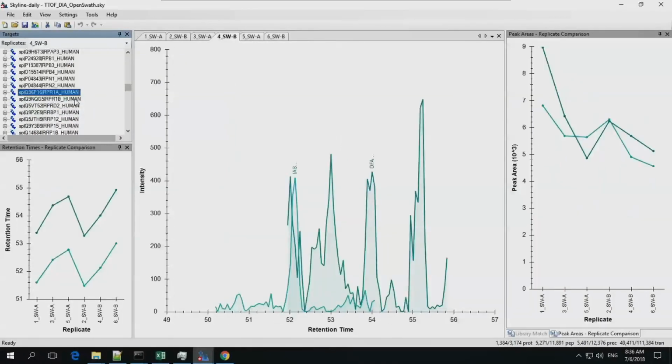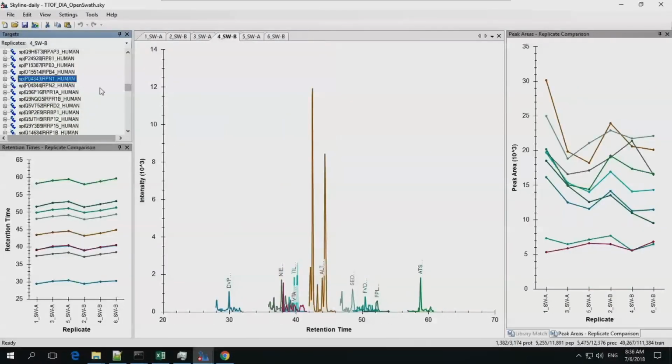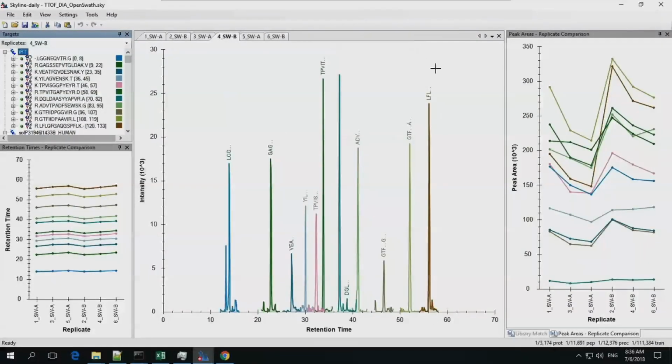All right, and then I wanted to go back to the IRTs and remember that we saw this effect in the IRTs. If this is supposed to be a straight line across, what do we learn about the A's and the B's from just looking at this? Now, I'm not saying that all of the IRTs are perfectly well behaved. I wouldn't necessarily use them as global standards to normalize by, but it's worth having a look at them because some of them should at least be straight across. But what do we see instead? What are the effects that you see there?